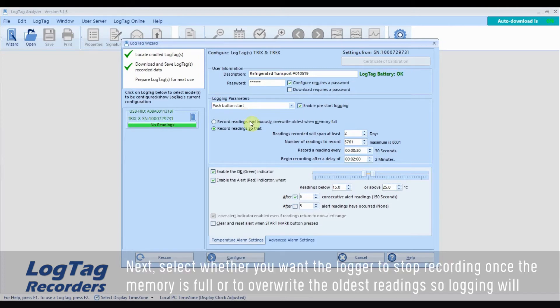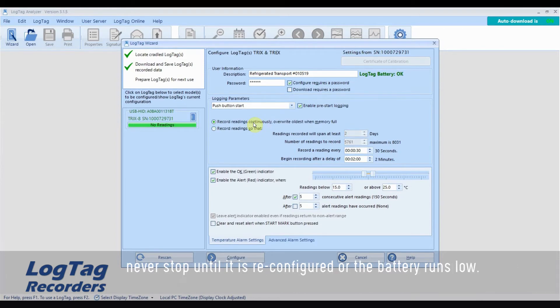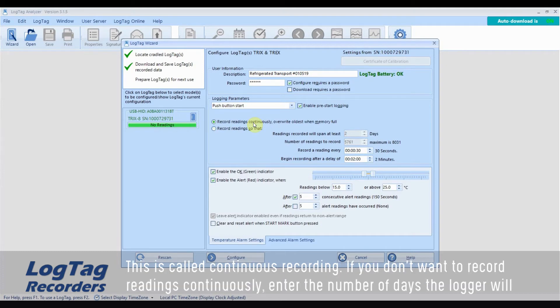Next, select whether you want the logger to stop recording once the memory is full or to overwrite the oldest readings so logging will never stop until it is reconfigured or the battery runs low. This is called continuous recording.